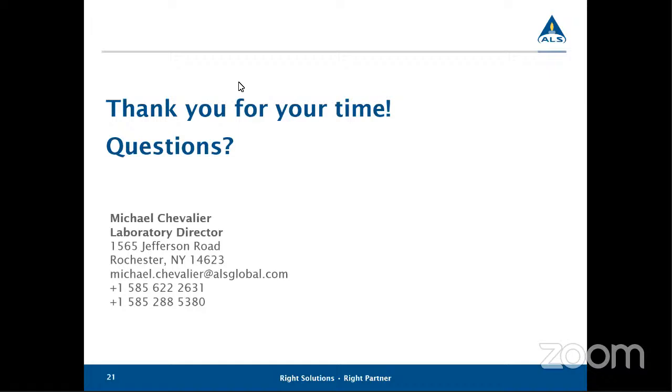Are the diffusion samplers available through ALS service centers? So the diffusion samplers are all manufactured and produced here in ALS Rochester. We have an online portal for ordering. So we can get them out to any of the service centers. We can ship them directly to you as the client, but they are really only kept in stock here in the Rochester lab.